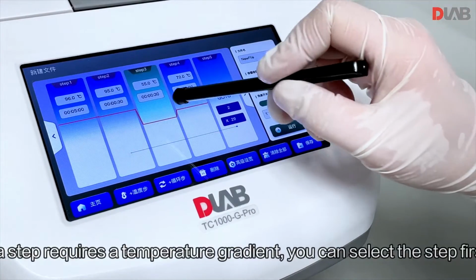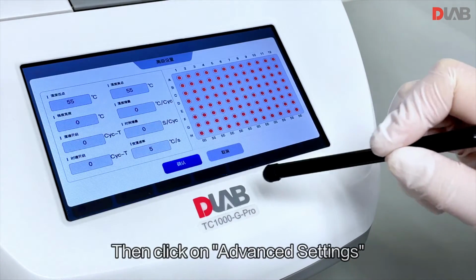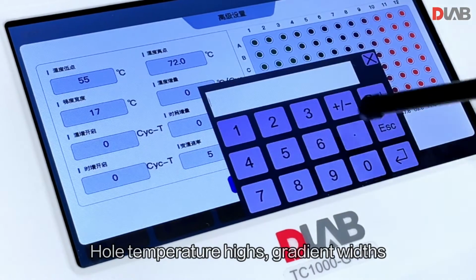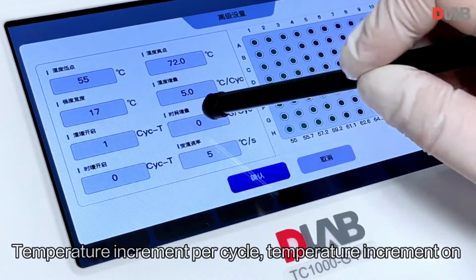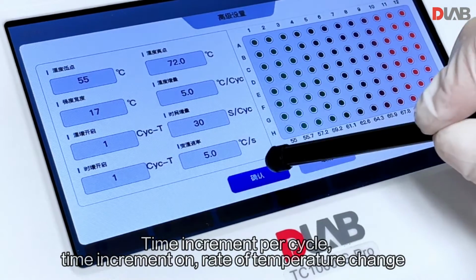If a step requires a temperature gradient, you can select the step first. Then click on Advanced Settings, setting the whole temperature low point separately, whole temperature high, gradient width, temperature increment per cycle, temperature increment on, time increment per cycle, time increment on, and rate of temperature change.